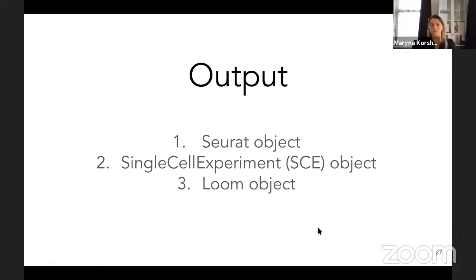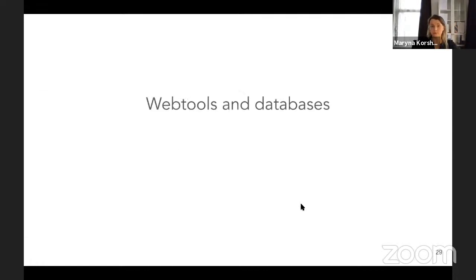It's usually S4 objects, which already include a lot of blocks with metadata and so on and so forth. So to handle different kinds of data sets and to be able to process data sets from different pipelines, you have these objects. And last comment from my side, a loom object you use if you work with very big data sets. So it's just some technical optimization of the data set processing approach.